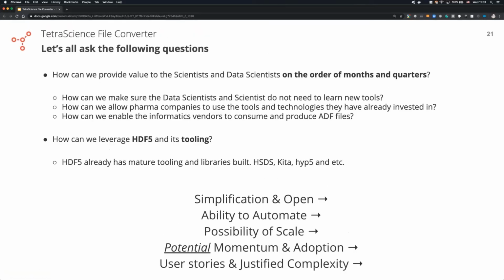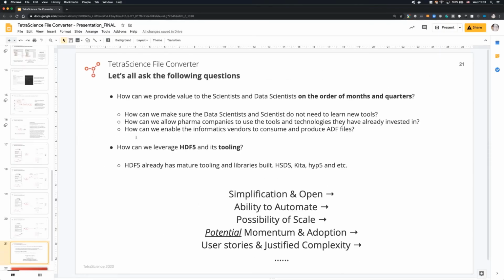Okay, thanks. Can you hear me? Yes. Excellent. Okay, thanks, Ben. There's a lot that I agree with on this, but there are a few things I take issue with. The first thing is equating the Allotrope format to being a commercial tied-in format. I don't think that's strictly speaking true, in that it will be available to all Allotrope members. And the second thing is, how do you read HDF5 without the HDF libraries?